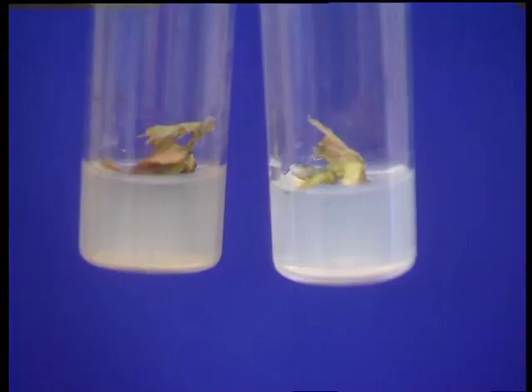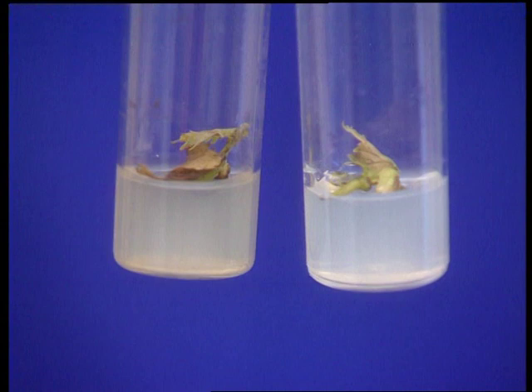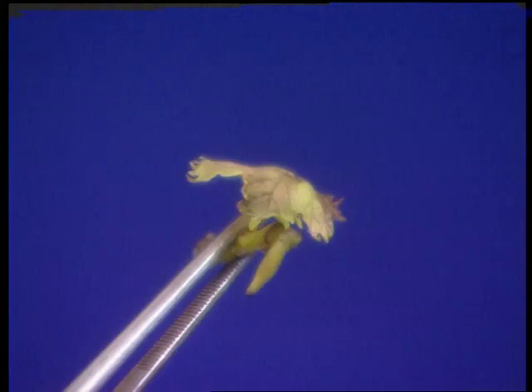Selection for uniform propagules and discarding the inferior, abnormal or diseased plantlets should be made at the start of this stage. Sometimes cultures deteriorate with time, lose leaves, fail to grow, develop tip burn, go dormant, or lose the potential to regenerate. Plants of a species having an inherent dormancy or rest requirement may need to be chilled to stimulate new growth and elongation. Other problems may require detailed experimentation to ascertain the reasons for lack of growth in cultures.